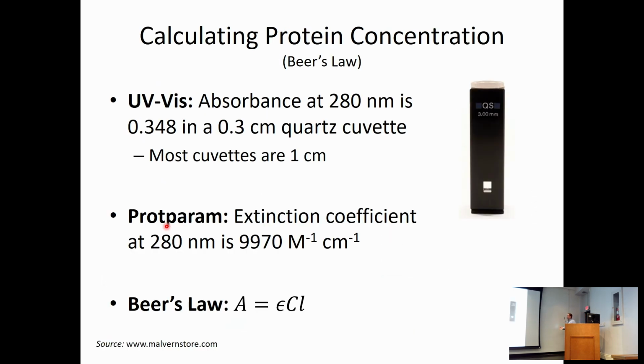And so this is generally going to be done using a cuvette. I'll try to stick to this. So this is a nice small cuvette. This one actually can handle, I think, 20 microliters. Your cuvettes in your lab will vary. Generally, protein solutions are precious, and so you don't use the gigantic cuvettes that you might use in an undergrad lab where it holds like 3 milliliters of solution. In this case, it uses a small volume. Some of you might even have labs where you're using like 1 or 2 microliters, using like a NanoDrop, for example, to measure the extinction coefficient.